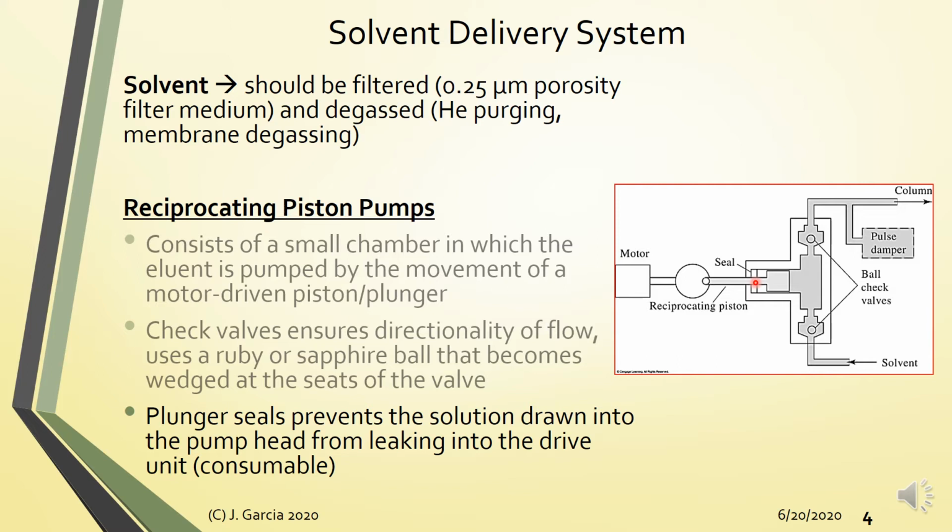Normally, pagka meron kang high back pressure, and you suspect na galing sa pump yung source, usual suspects are your check valves. So normally from time to time you have to clean this up, kasi pwedeng merong dumi that prevents your check valves from moving freely during the pump operation, and thereby increasing back pressure.